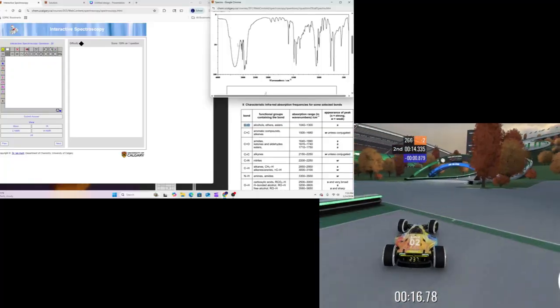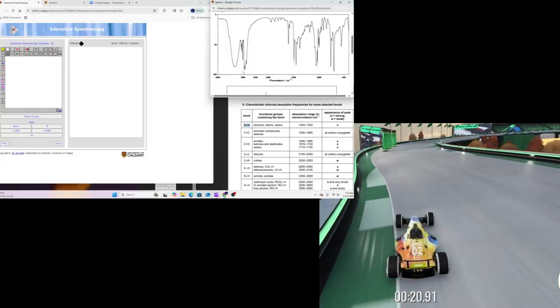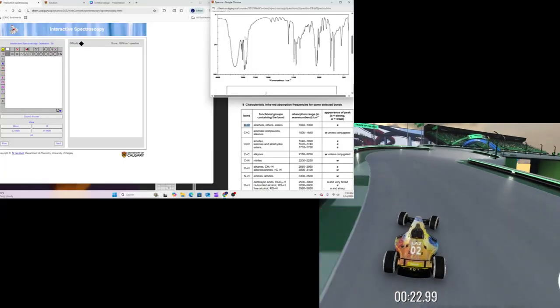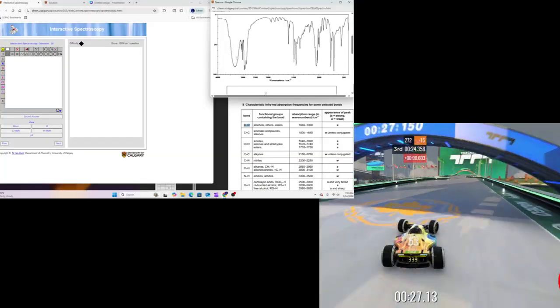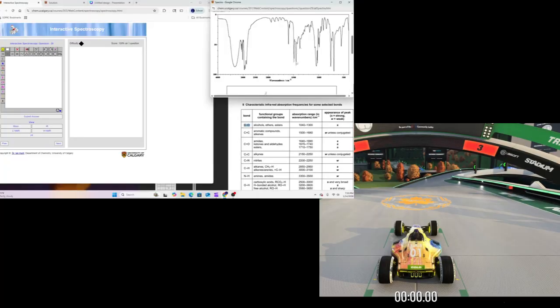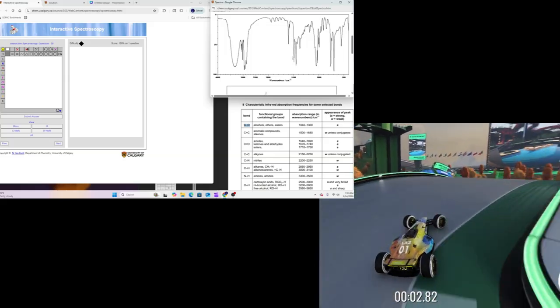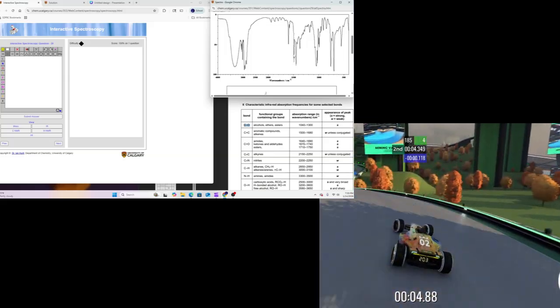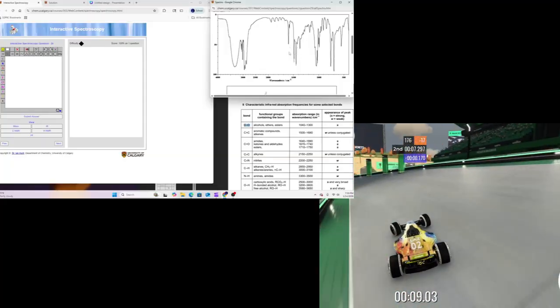We should see that we have this right here, which is a nice OH bond. Okay, and we're going to notice that because that shape is just so unique right there. And then we're also going to take note that here we have a stronger signal here. Okay, now our line is going much deeper down here in this 1500 zone. Okay, and it goes a little bit past here.